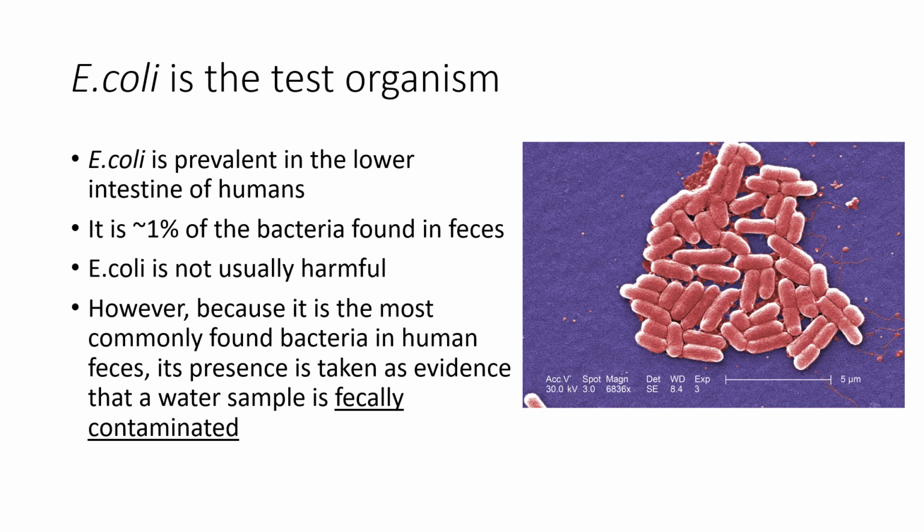But because it is found in human feces, commonly found, everybody's got it, I can test for the presence of E. coli, and that would tell me that feces is present. So we test water samples for E. coli in the coliform analysis to see if that water sample has feces in it. I am not concerned necessarily with the E. coli. In most cases, E. coli is no problem whatsoever.